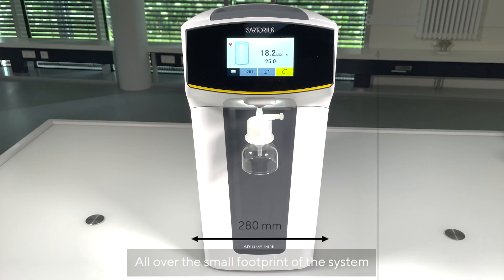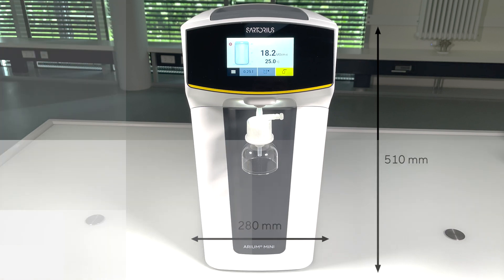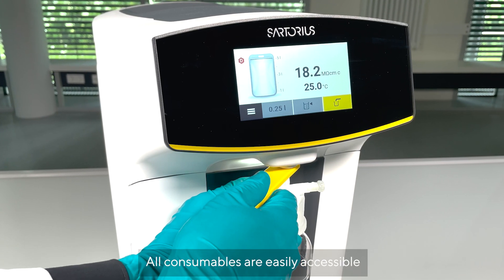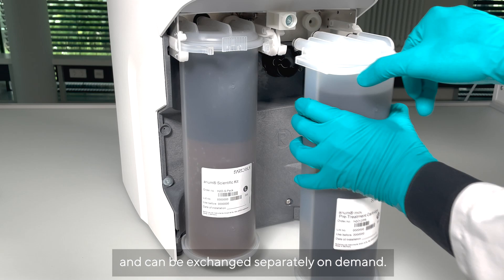The small footprint of the system makes it easy to fit the Arium Mini into your lab. All consumables are easily accessible and can be exchanged separately on demand.